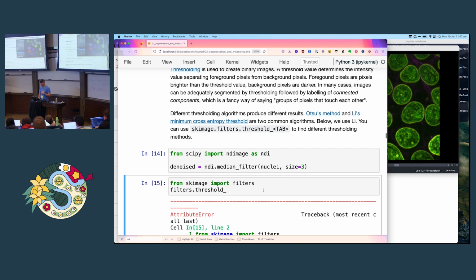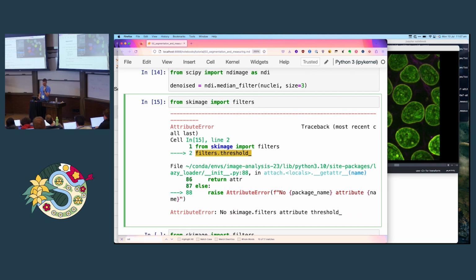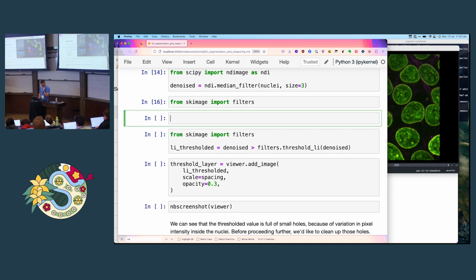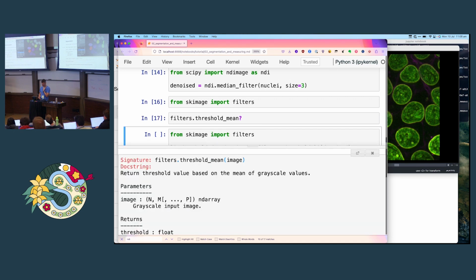By the way, another thing that you can do in napari, which is nice, is you can see the coordinates of the cursor on the bottom left of the viewer. Sorry that the font is not going to be good from the back, and then you can see what the label is that's sitting under the viewer. Okay, so this is now nucleus 14, this is nucleus 9. All of these are labeled as 7.